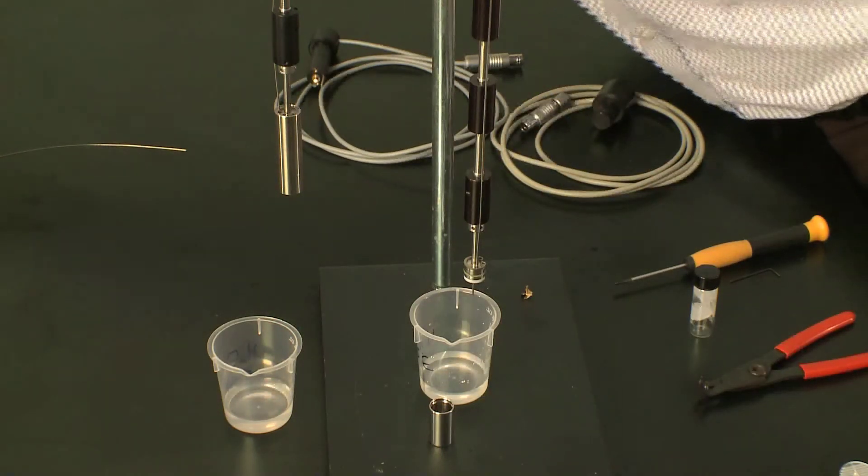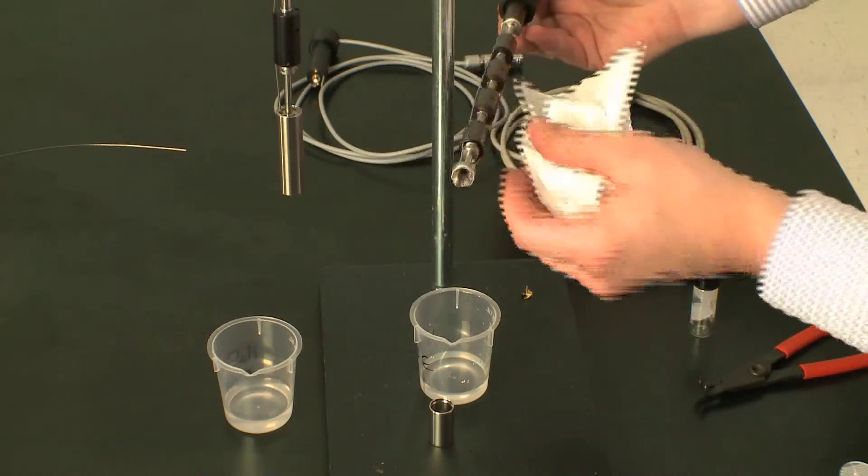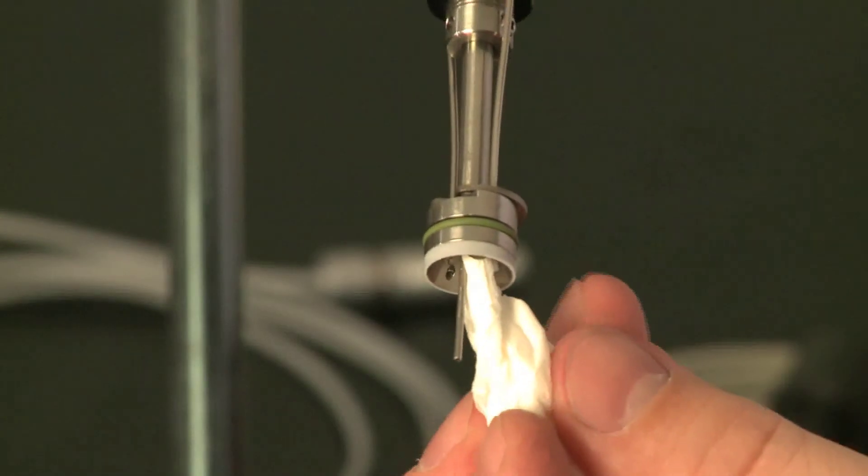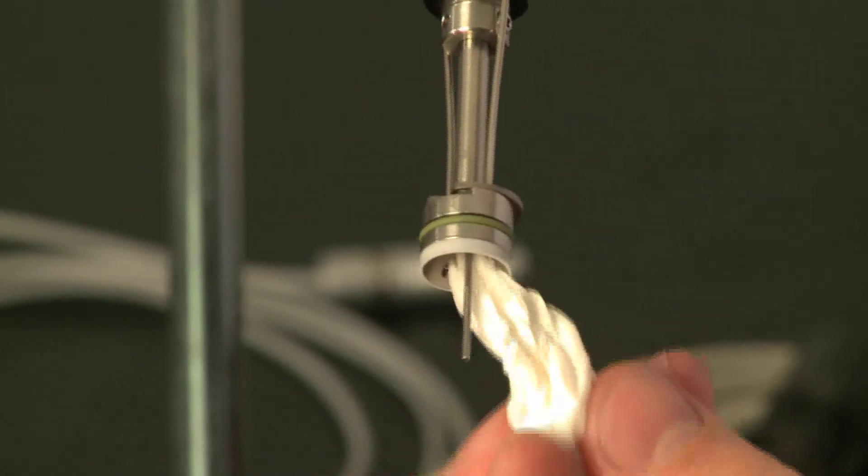Then the final step is to make sure that there are no water droplets on the bottom here that can fall into your sample. So we just dab those dry.